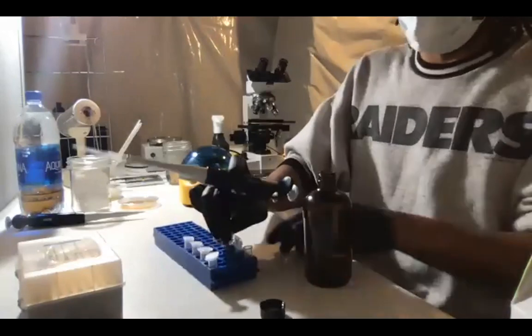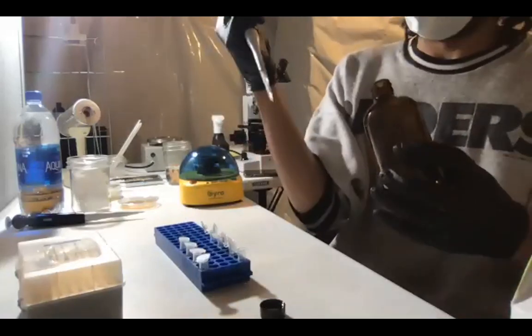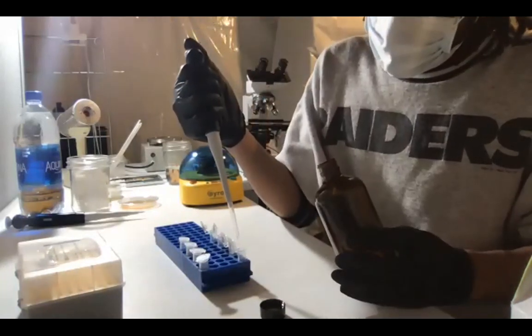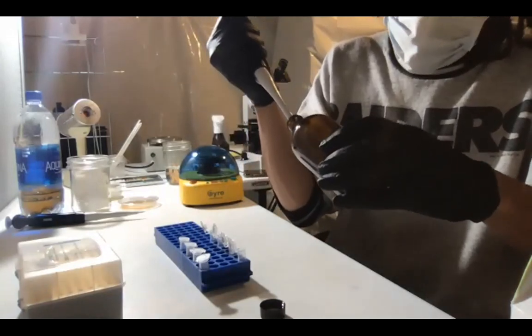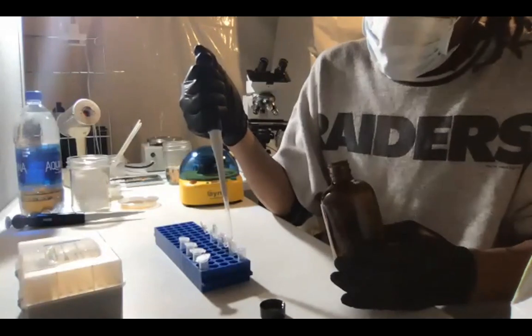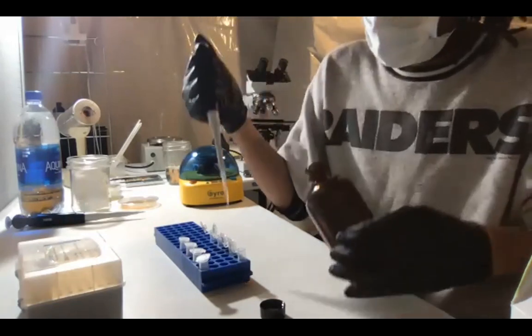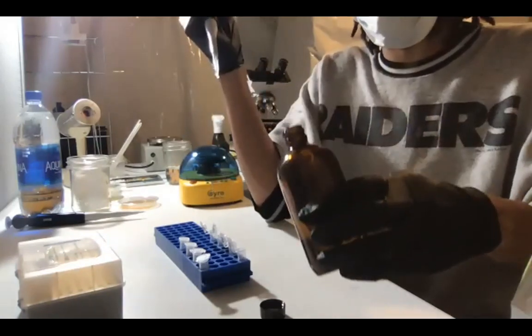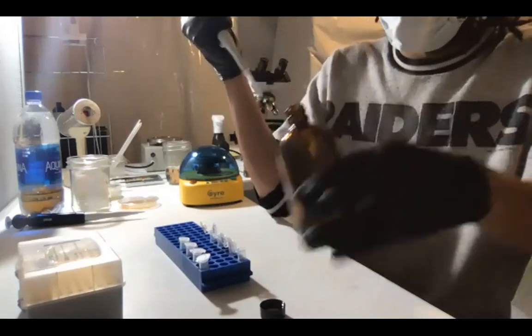Again, like I said, because you're not sticking these directly into the centrifuge tubes, you can use the same pipette tip for this step. Go to the first stop, draw up your liquid, do it slowly, release it to the second stop. Again, don't touch the tubes. You'll cross-contaminate if you touch the tubes. If I touched the tube and went back into my dilution solution with a little bit of this mycelium on my tube, I will contaminate my entire dilution solution, and I will have contaminated results for any other thing I use after this. So because of that, some people will just take their dilution solution and put it in another container, and then just use it out of another container for each run. I don't really find that to be necessary.